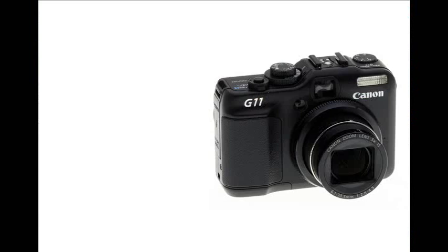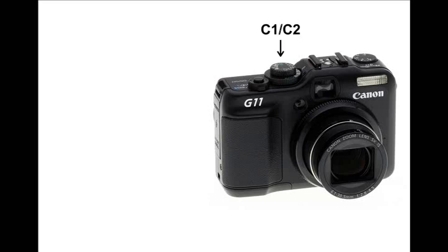Before you start shooting, you'll need to set up the camera. This involves using the dials and menus to save certain settings necessary to get optimal shots for the panorama. If the camera, like our G11, has custom program slots, it will be good to save all settings in one of these for recalling later.